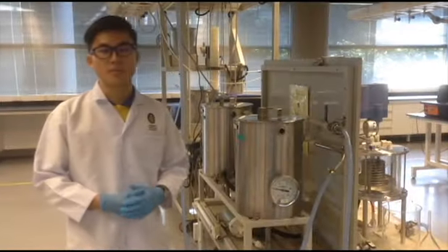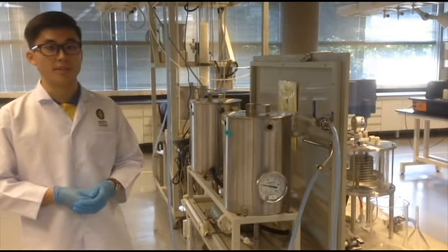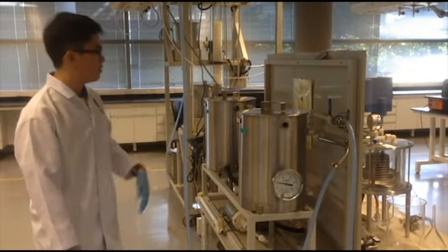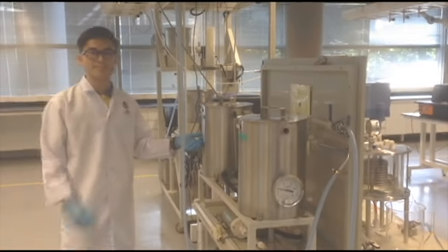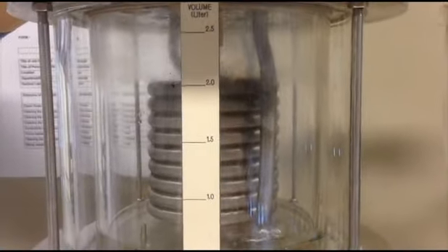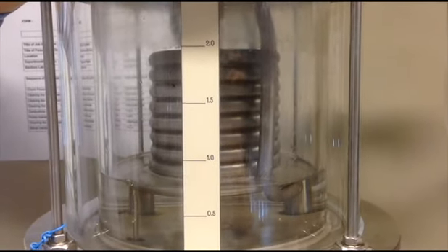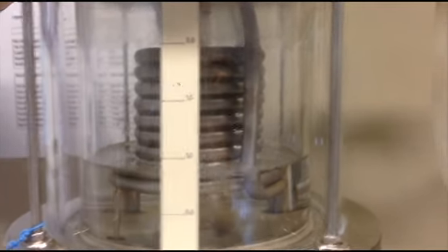Next, for the next experiment, which is the batch saponification reaction of ethyl acetate and sodium hydroxide, prepare 5 liters of ethyl acetate and 5 liters of sodium hydroxide and transfer them into the feed tank. To begin a batch reaction experiment, switch on pump 2 and start pumping 1 liter of 0.1 mole of ethyl acetate into the reactor. Afterwards, switch off pump 2.